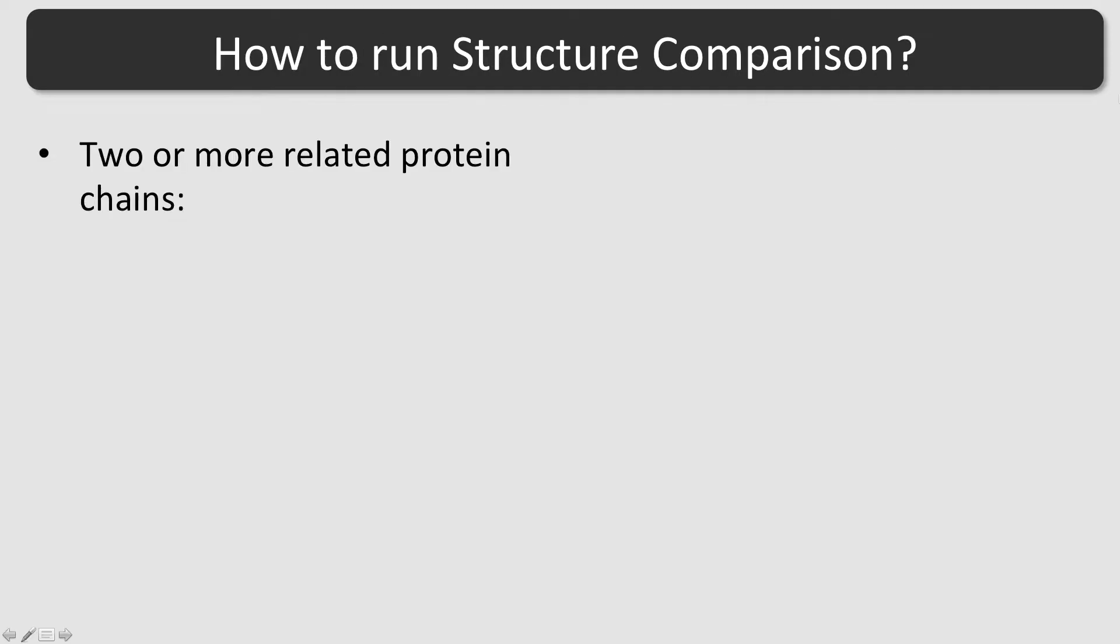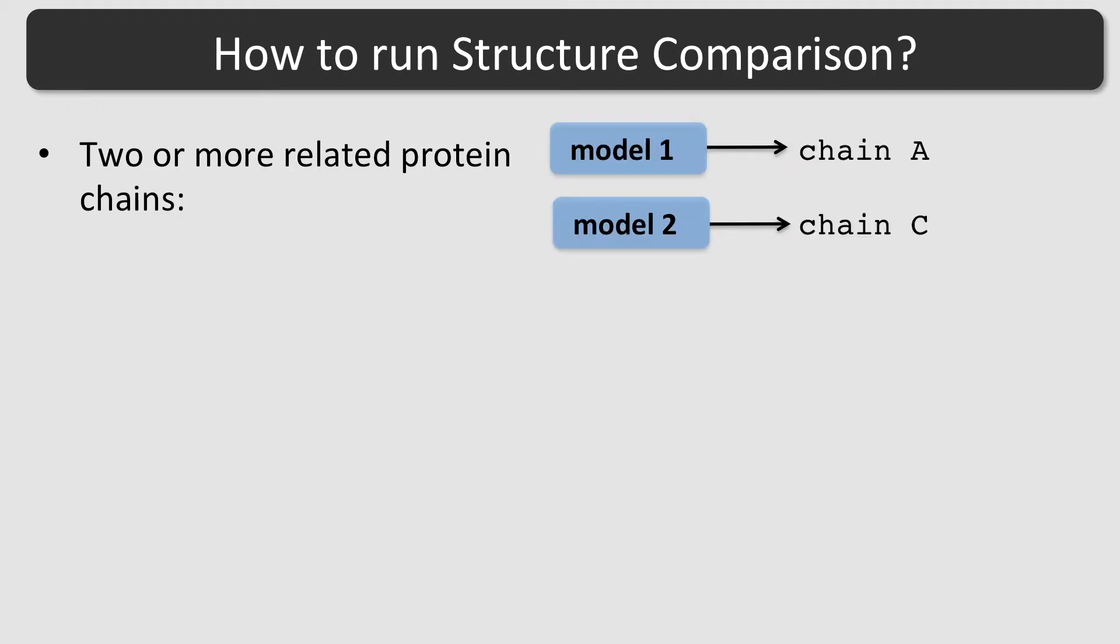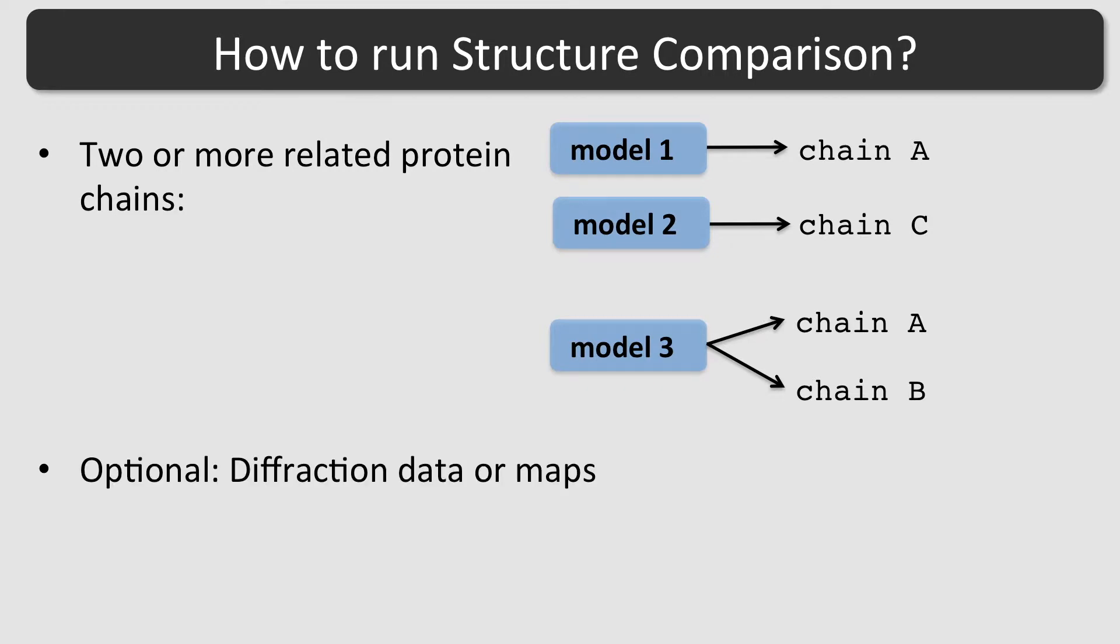To run Structure Comparison, at least two or more related protein chains are required. It is possible to use separate files or NCS-related copies in a single file. Optionally, diffraction data or pre-calculated map coefficients can be provided so that maps can be shown in addition to the protein chains.